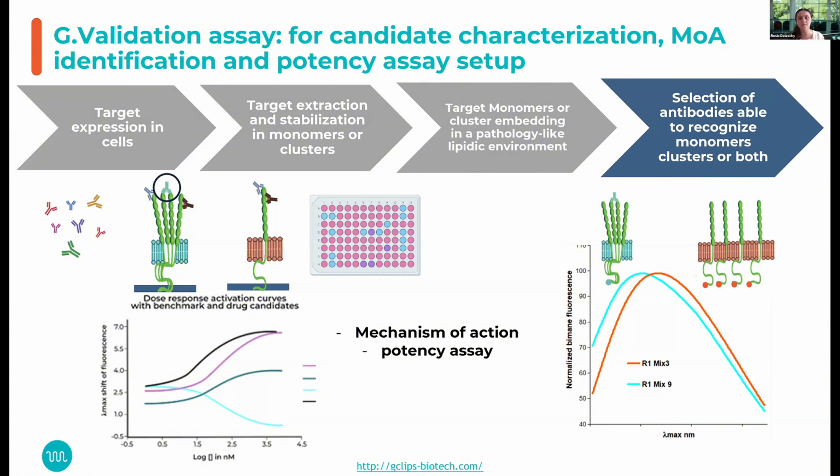to be able to see both formats used for immunization and then for characterization, and also to have the mechanism of action. And in this case, this assay that we have developed was then used as a potency assay for the batch release.